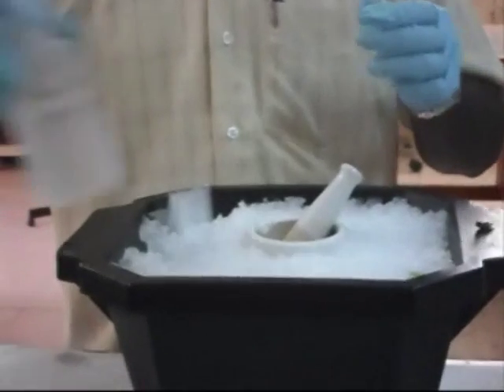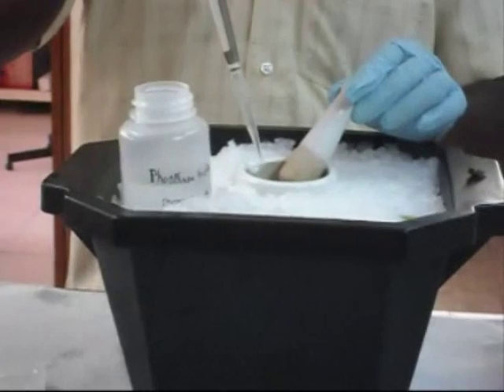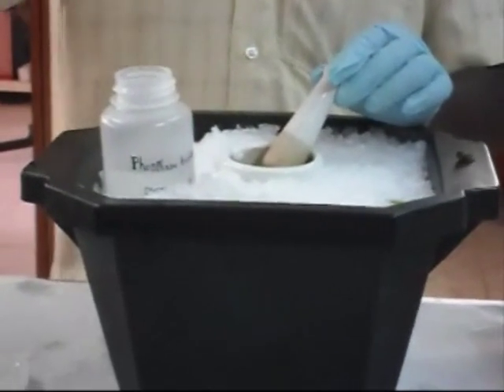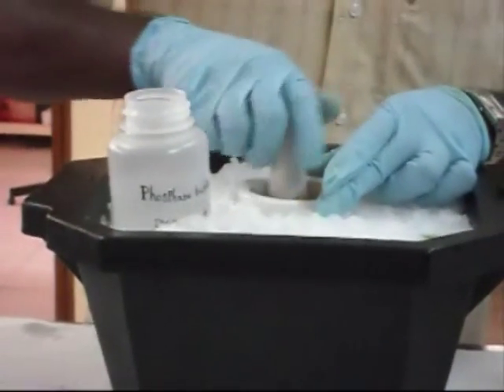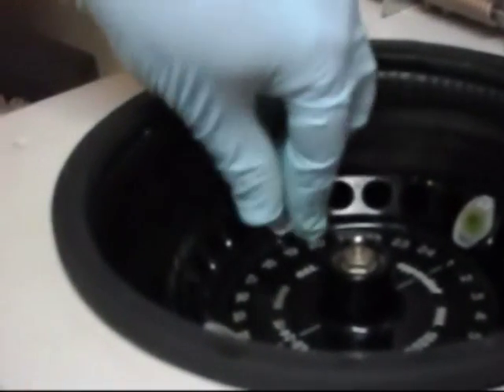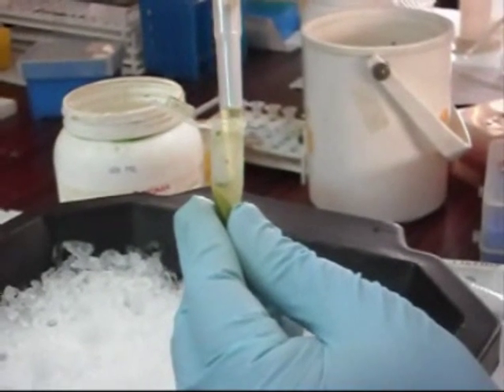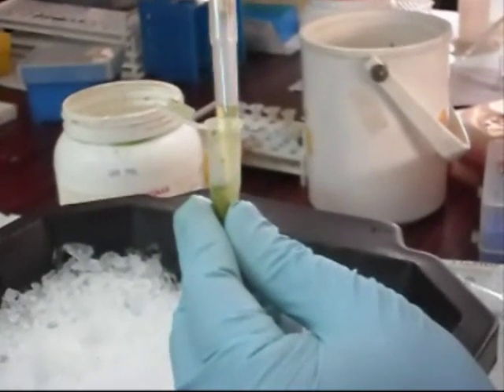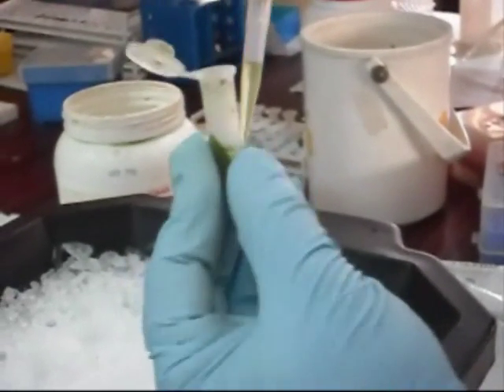The leaf tissues are ground along with the addition of phosphate buffer. These are transferred into Eppendorf tubes and centrifuged at 12,000 RPM for 20 minutes. The protein containing supernatant was collected and stored at minus 80 degrees Celsius for further use.